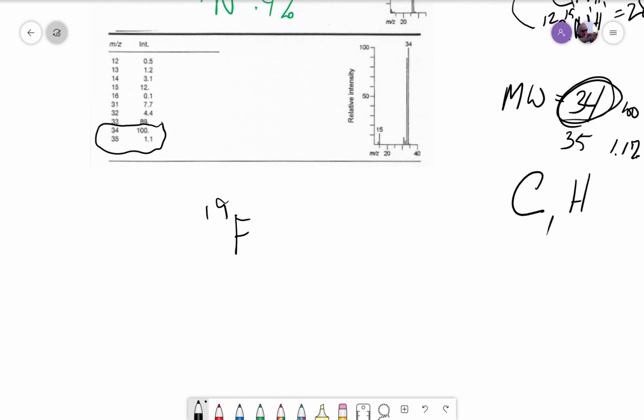The fact that we don't see any other isotopic information suggests that there has to be additional mass being added by A-type atoms, or things that don't add additional isotopic information. If fluorine were 19, then we could deduce that the empirical formula would be CH3F. The only isotope that would show up would be the C13 peak at 1.1%. The total mass would be 34.